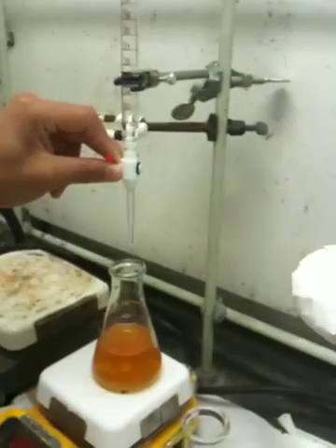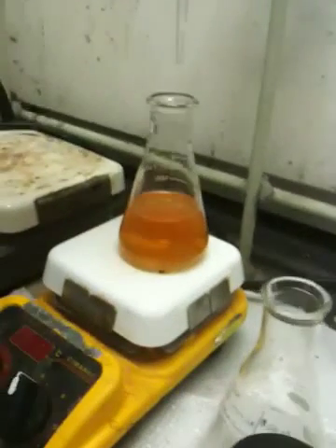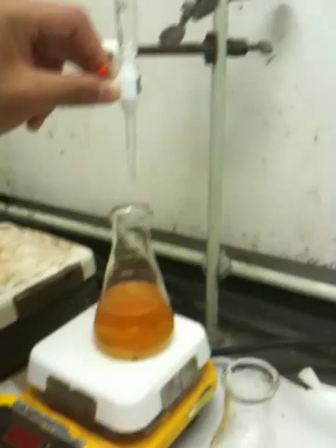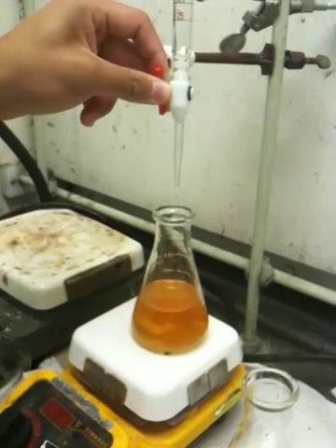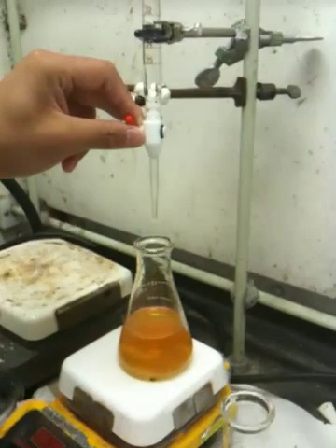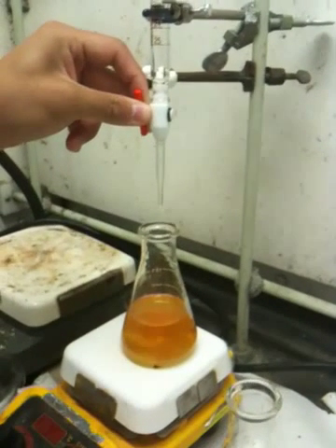And you can see as he's titrating, the reddish brownish color that it originally was is changing gradually to a nice urine-looking color. Eventually Dice K is going to need to get it down to a nice pale yellow. The problem is, if you add too much, that pale yellow quickly becomes clear and then you're pretty much screwed.